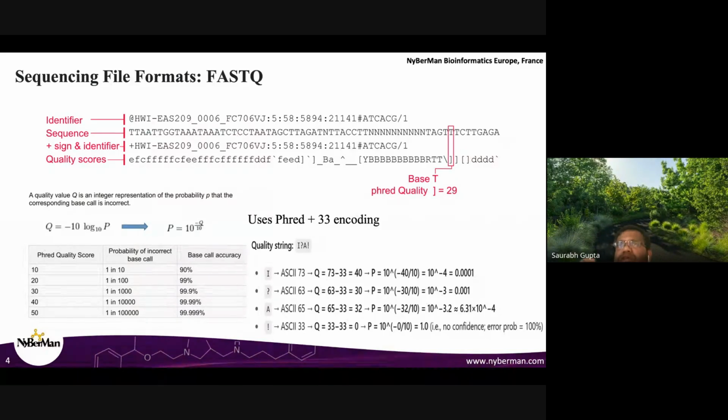You can think of cameras capturing the color as soon as a fluorophore is released. The capture is based on a certain intensity, so even red can have a slightly varying intensity.